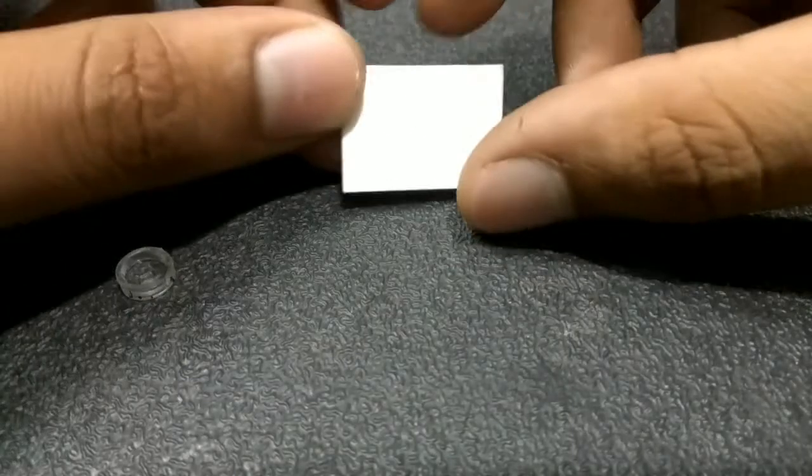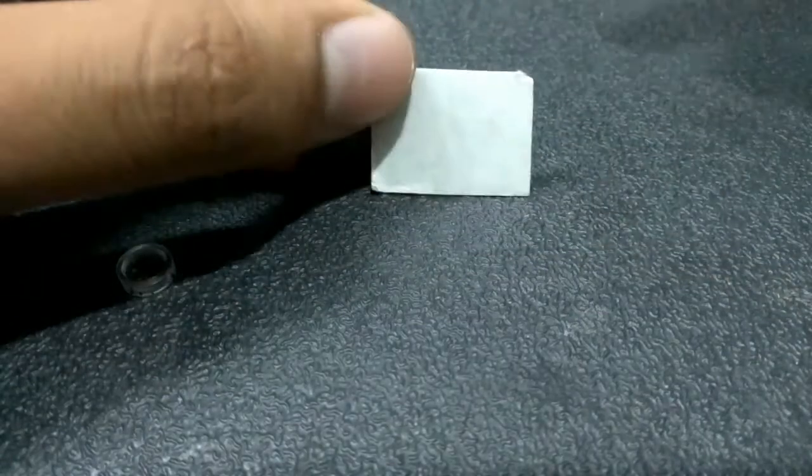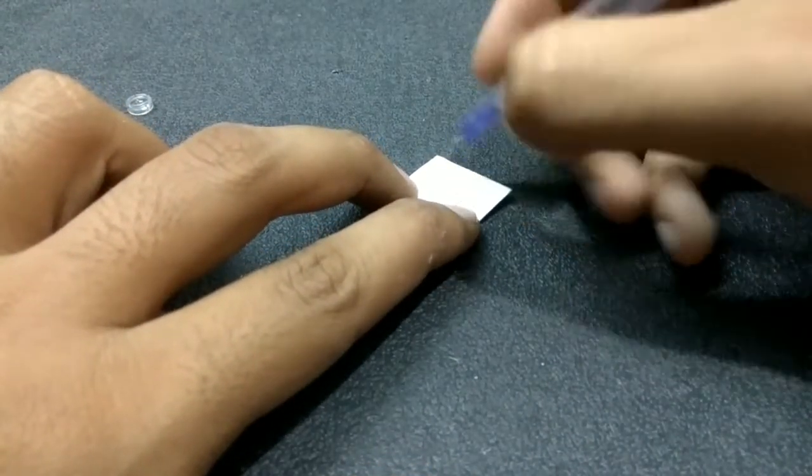In the next step, we need a small card to mount the lens on. This is a simple paper card — you can use any material you like. Draw a circle on the card the same size as your lens.